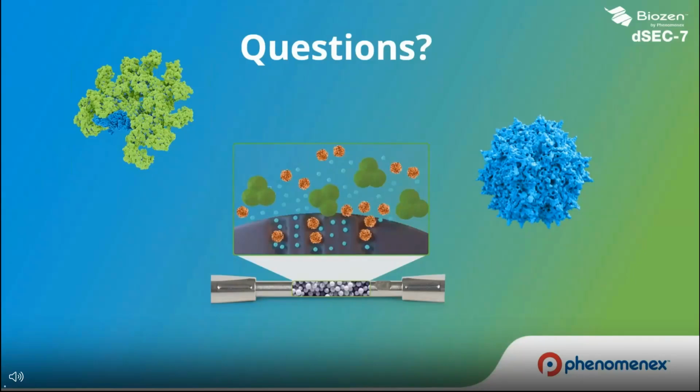So yeah, sure. All right, here is another question. Based on your experience, what type of performance can we expect from various batches of this column? Right now, based on my experience of running at least 3 different manufactured columns, meaning different lots, different batches, what I've seen is that with the recovery, there is no difference. We always recover 100% of this AAV. With regards to the retention time, there might be a very, very minor shift from lot to lot, but the shift is probably 2 or 3 seconds across a 3-minute elution of the AAV. So there is absolutely no problem with identifying which one is your AAV monomer versus any impurity or aggregate.